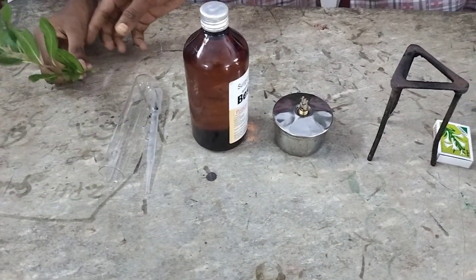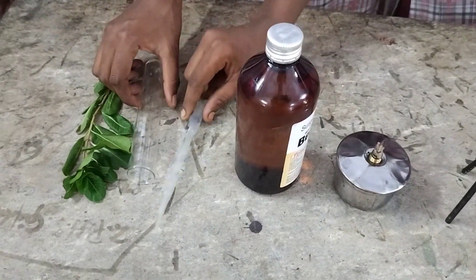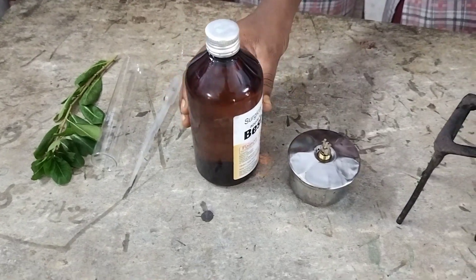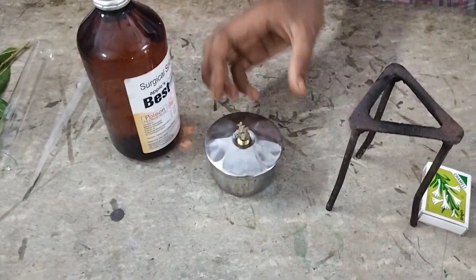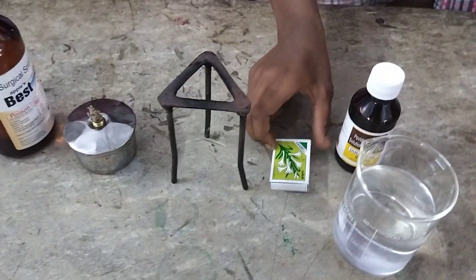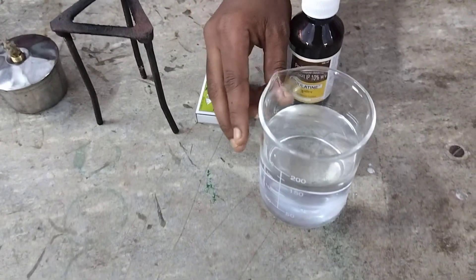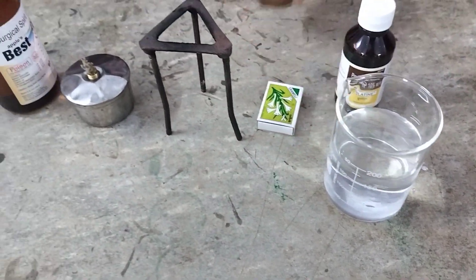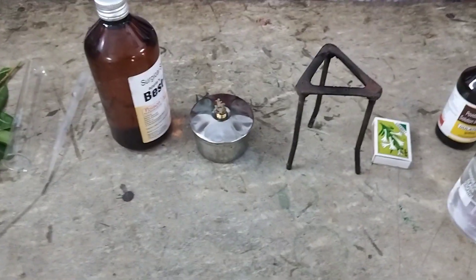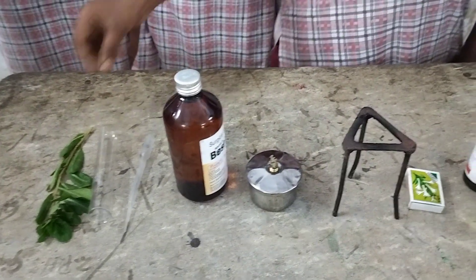Materials required are periwinkle leaves, boiling tube, dropper, spirit — I took surgical spirit here — spirit lamp, tripod stand, matchstick, matchbox, iodine, a beaker with water, another beaker with hot water, and one steel glass.